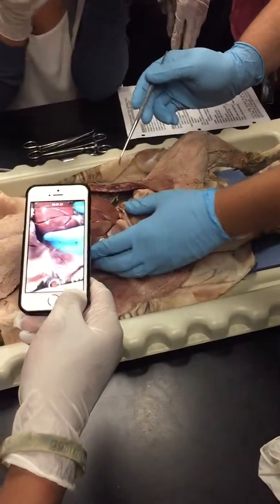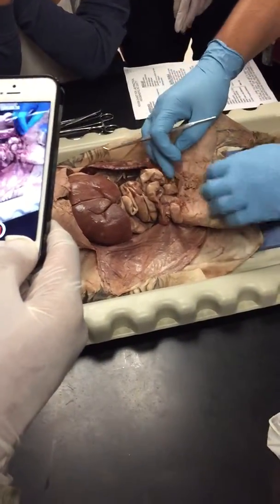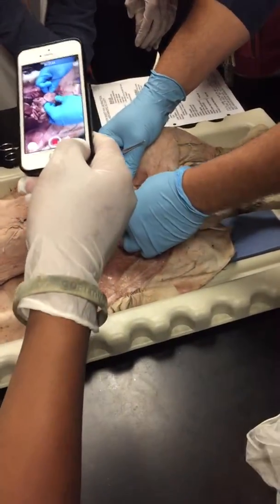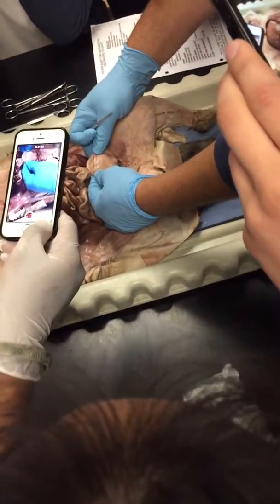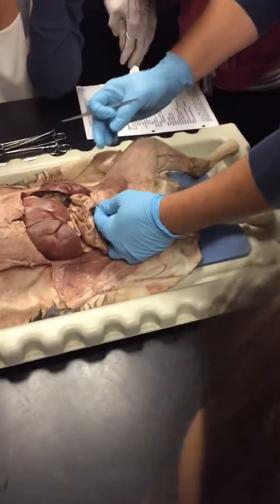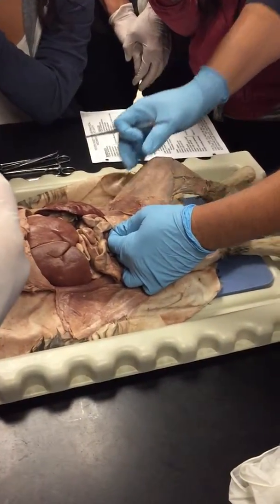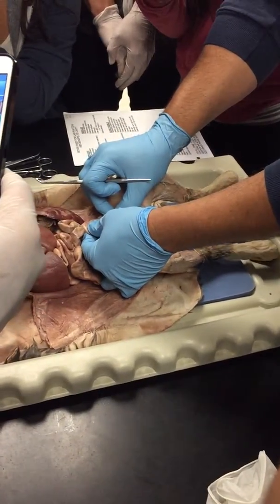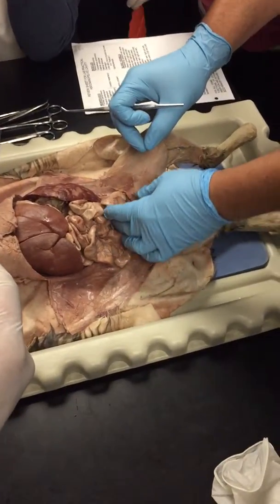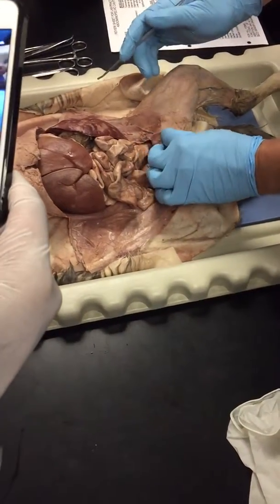All right. Let's make sure we got all of this. Attached to this organ used to be suspensory ligament. Okay, and that's the difference between today and yesterday, you guys. I'm asking you to see if you know, okay? Used to be the suspensory ligament. Now, if I ask you anything about the suspensory ligament, I'm going to choose a cat that actually has some left, okay? So I'm not going to try and trick you, all right?